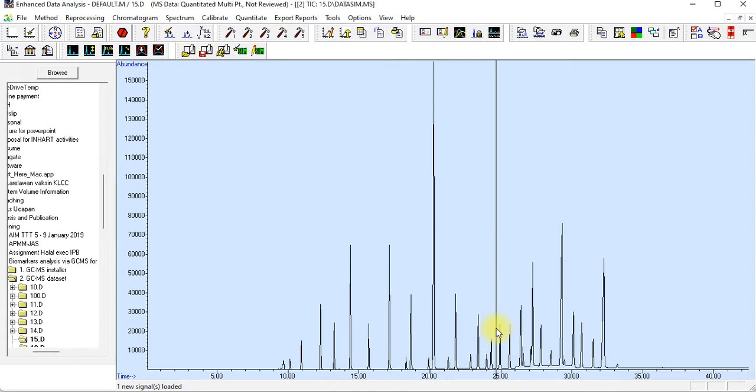At this particular time when I analyzed the sample, the GCMS ion source had been cleaned first, and then the laboratory purchased a new HP88 column, a very new column, so that's why you can see it's a very clean separation. Don't be jealous of that. Some laboratories were so rich at that particular time compared to today. But the good thing is I can give this data to all of you, and then you can see how a clean separation looks like.